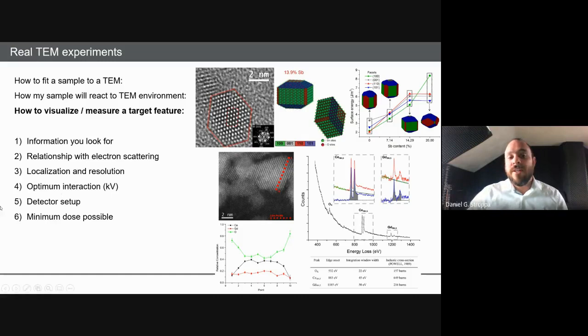With this, in recent years, there has been a push to play smarter with the detectors to work at a lower dose. And this is the last part of the talk here. I may need to cut it shorter because of the time. If you have interest, I can go into more detail. It's just a concept on how to use a segmented detector to get smarter with your detection, to be able to see more and see with less dose.